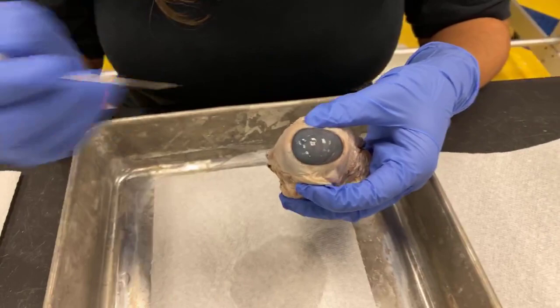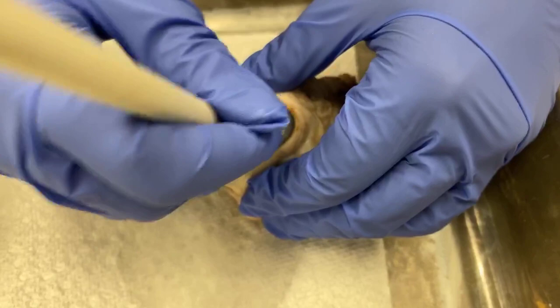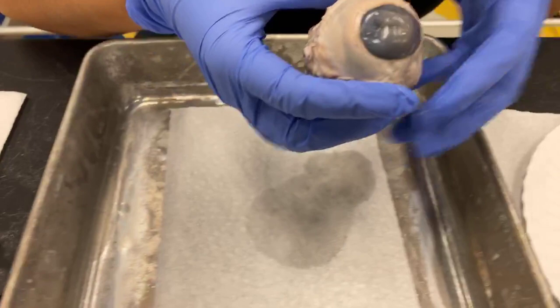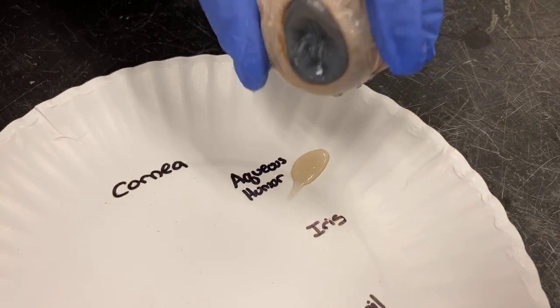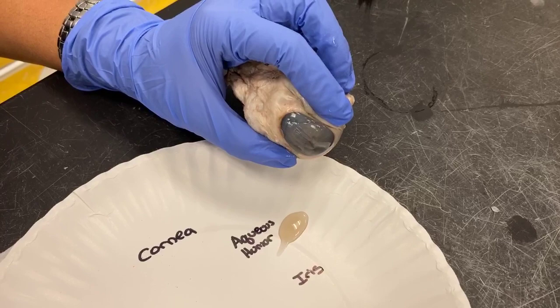So what I'm going to do now is move deeper into the eye and take a look at some other parts. I'm going to poke through the cornea. You might notice we get a little bit of liquid coming out — it's watery. That's called the aqueous humor. If you look back at the eye now, it looks a little bit shrunken. The aqueous humor helps give the eye its nice round shape and helps us focus. Now that we've taken it out, our eye looks a little bit wrinkled.